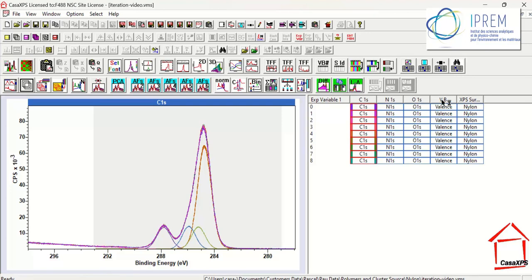In this video I'm going to look at how we can identify within a set of spectra in a VAMAS file which data have been processed in some respect: peak models, regions, or actual processing such as calibration. And the way you do this is using these three new toolbar buttons.